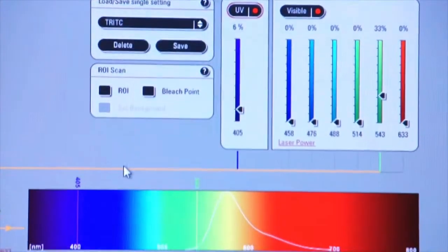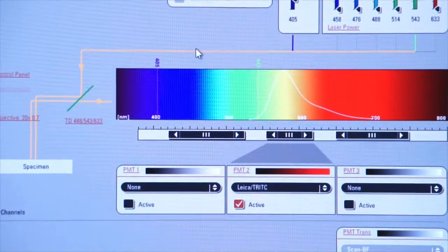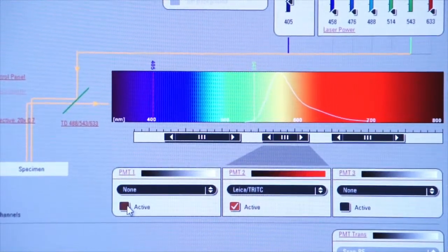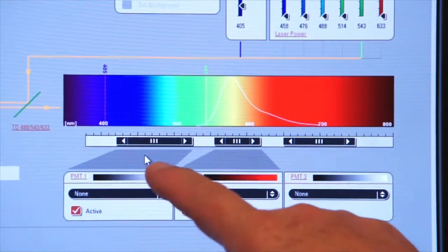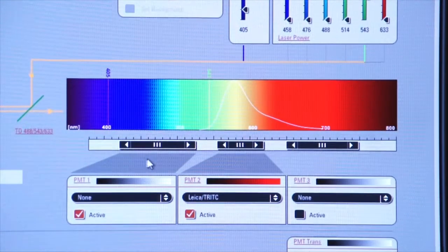You see the 405 line being generated, and now I can activate this PMT. Now you see the gray area indicating that the PMT is going to select information from that region of the spectrum.